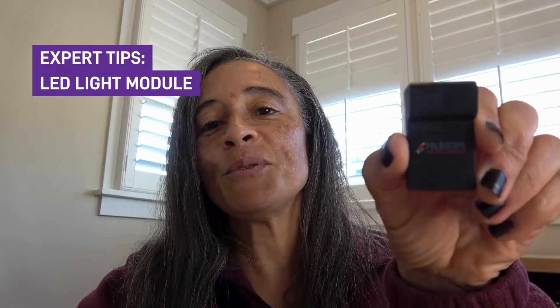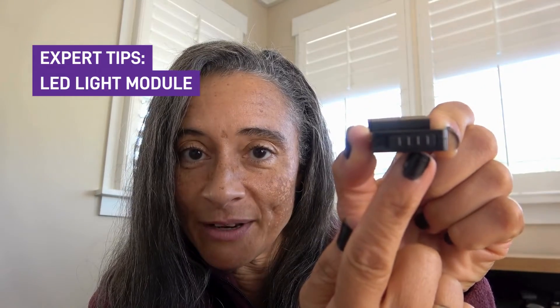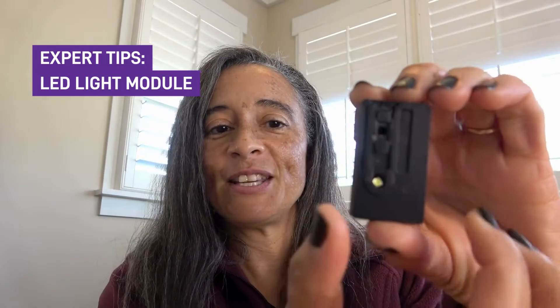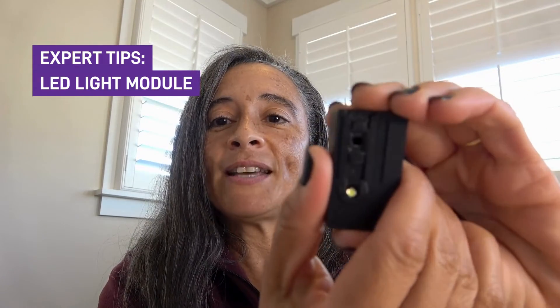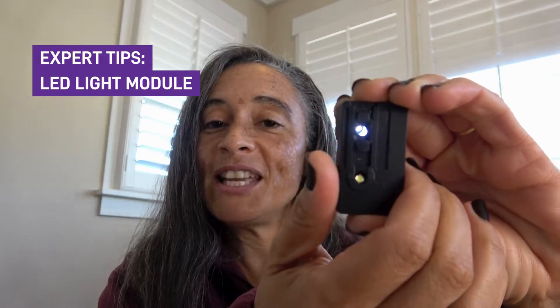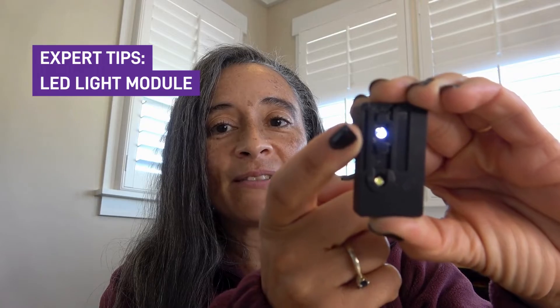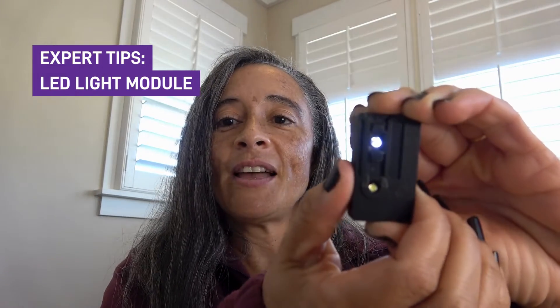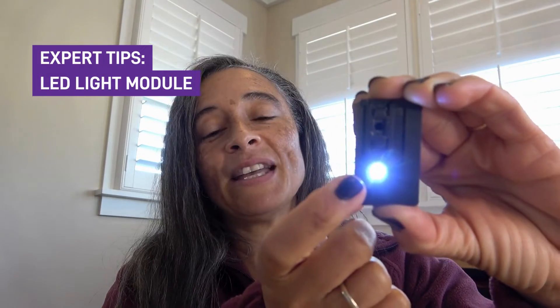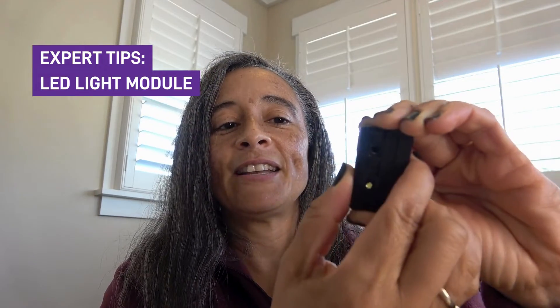This is the Foldscope 2.0 LED light module. The power switch is a toggle switch on the very bottom and it will let you click three times. When you click it one time, this light comes on. When you click it two times, the light gets a little bit brighter. And when you click it a third time, you'll see that the bottom LED light turns on. We'll talk about when to use each of these different lights in just a second.